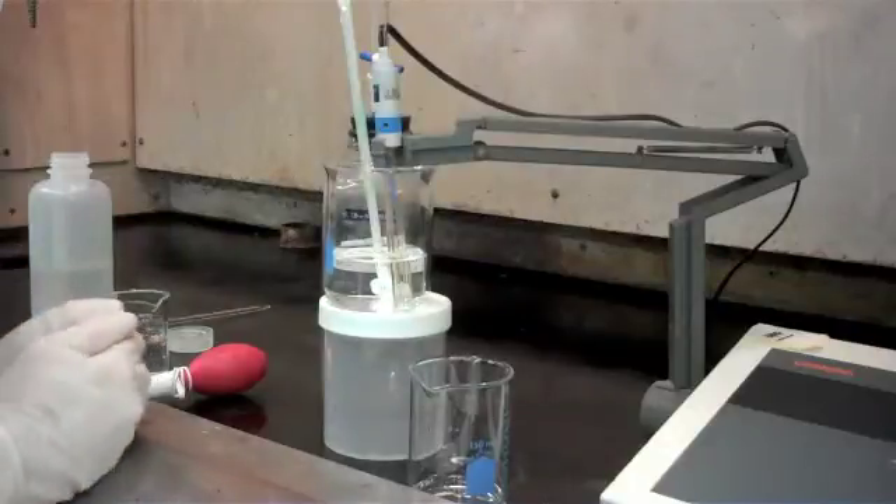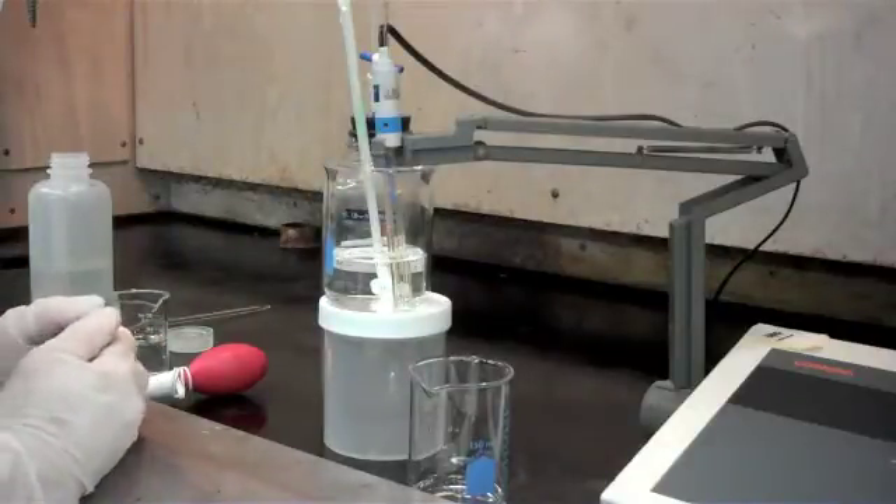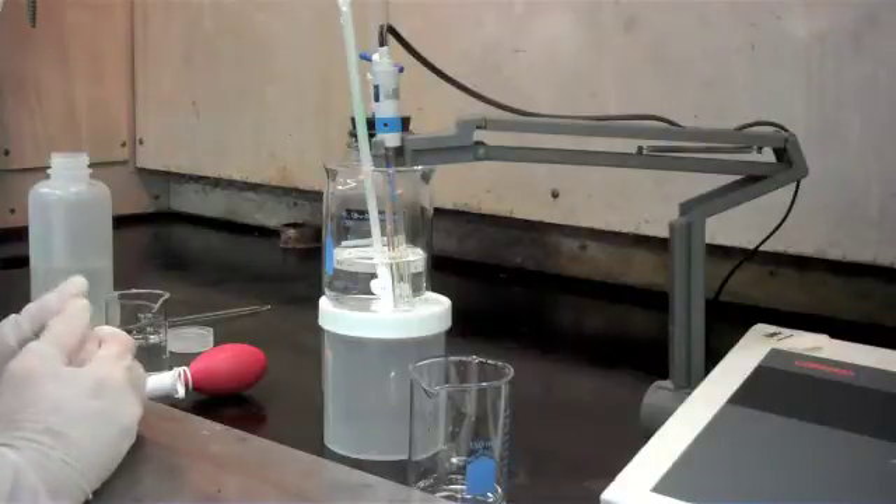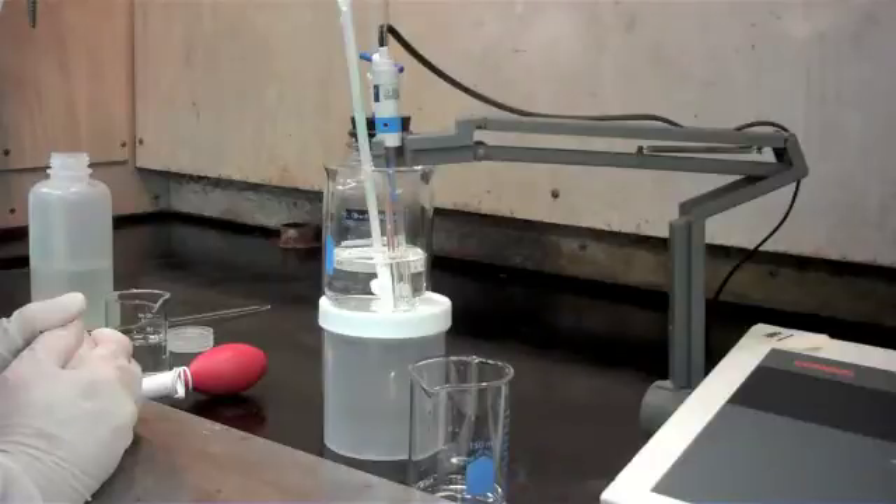You can only perform this method accurately if you standardize your pH meter on a regular basis. Here at HeatBath we calibrate our pH meter daily, and we use pH buffers of 4, 7, and 10.